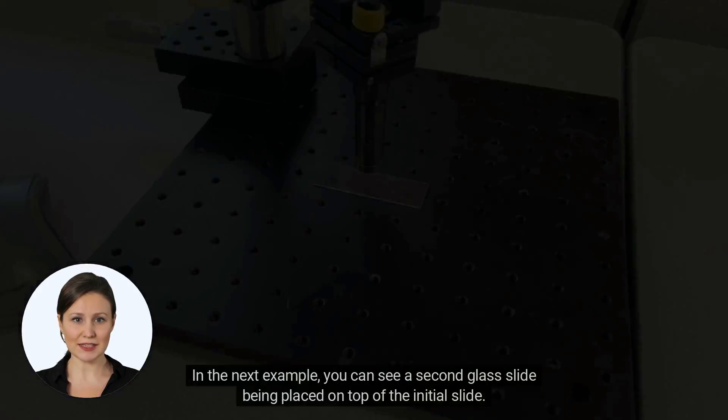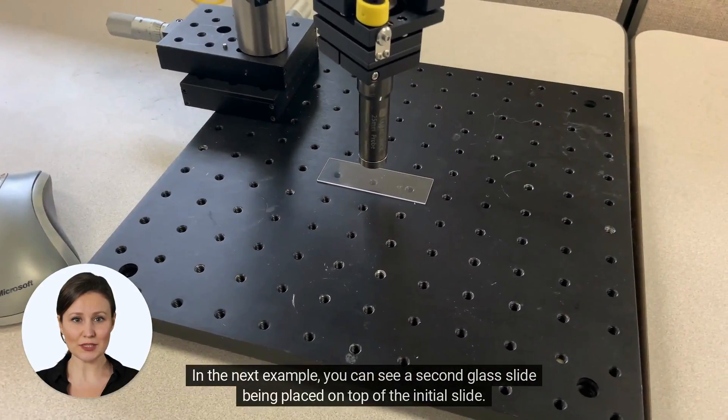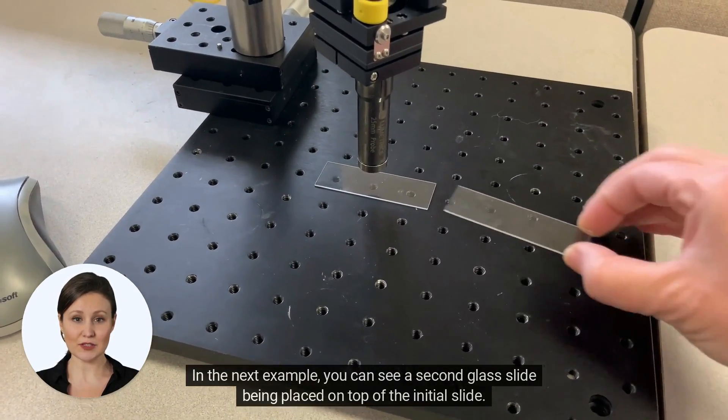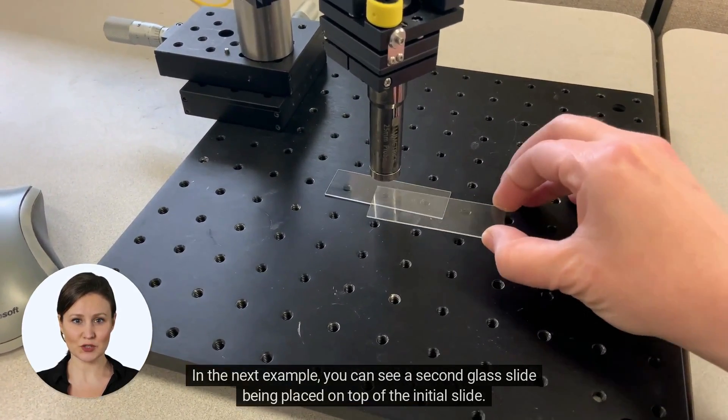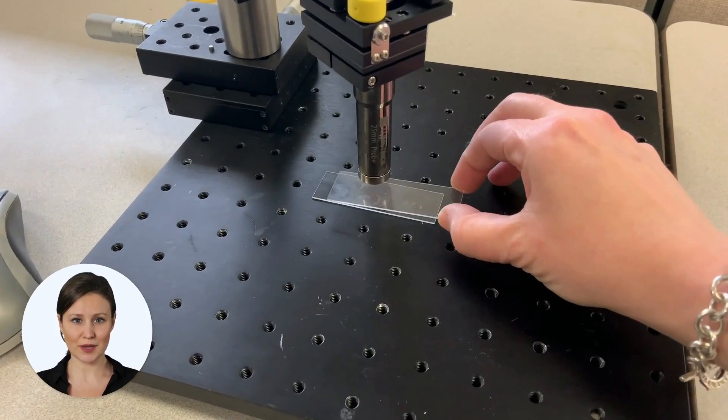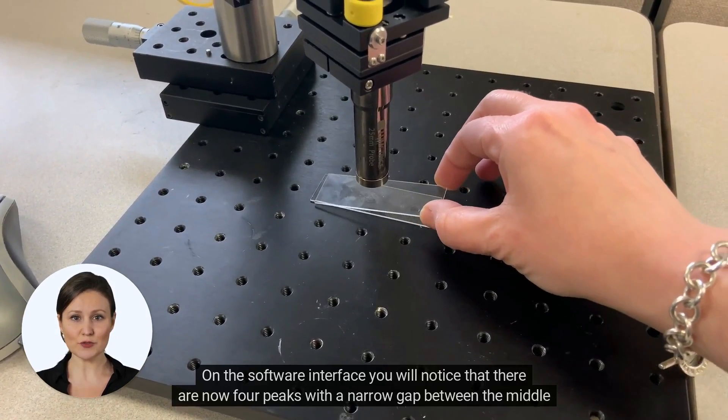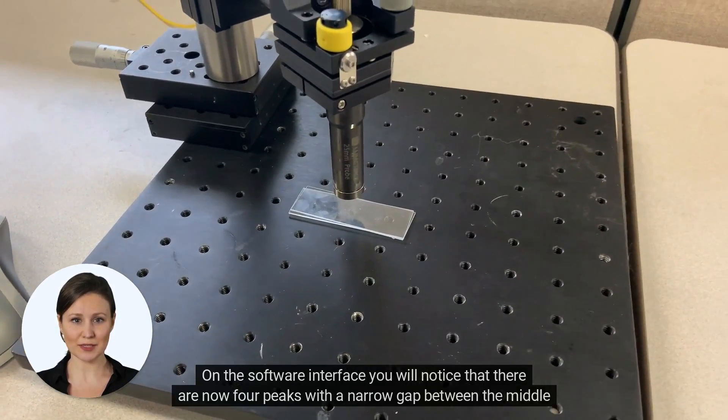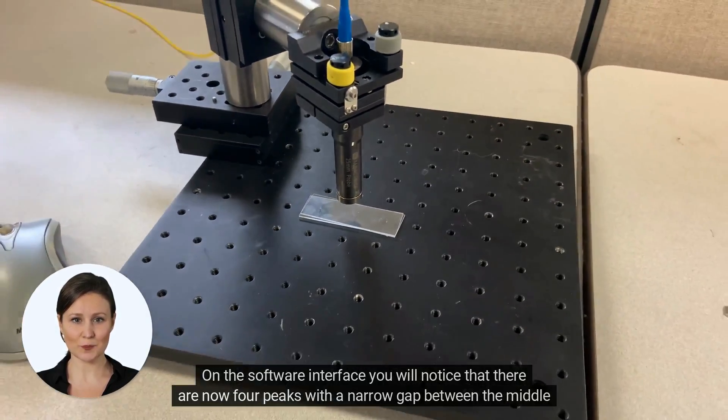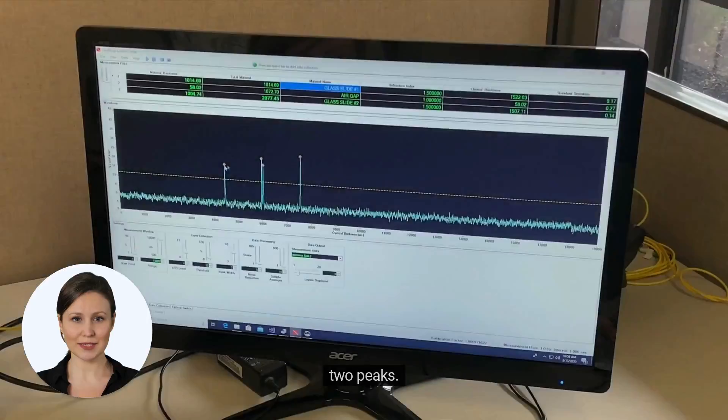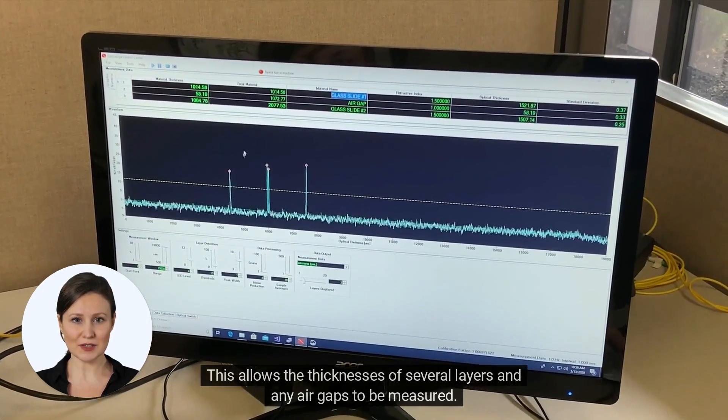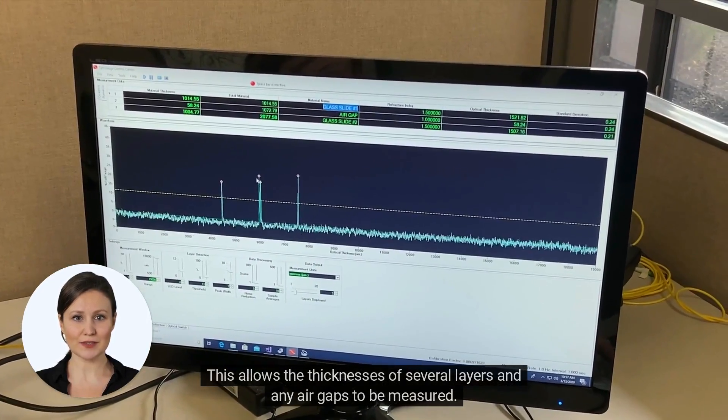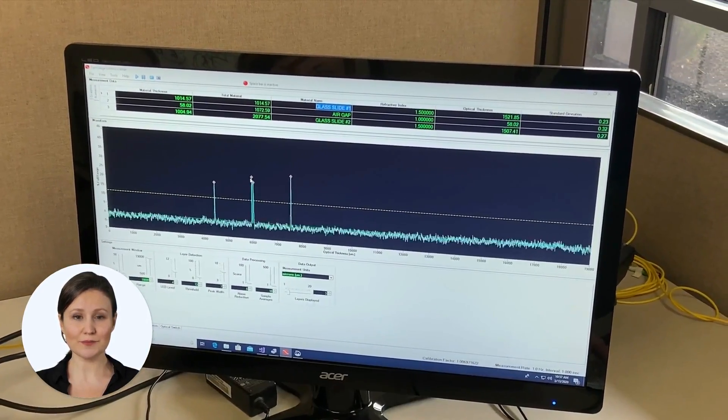In the next example, you can see a second glass slide being placed on top of the initial slide. On the software interface, you will notice that there are now four peaks with a narrow gap between the middle two peaks. This allows the thicknesses of several layers and any air gaps to be measured.